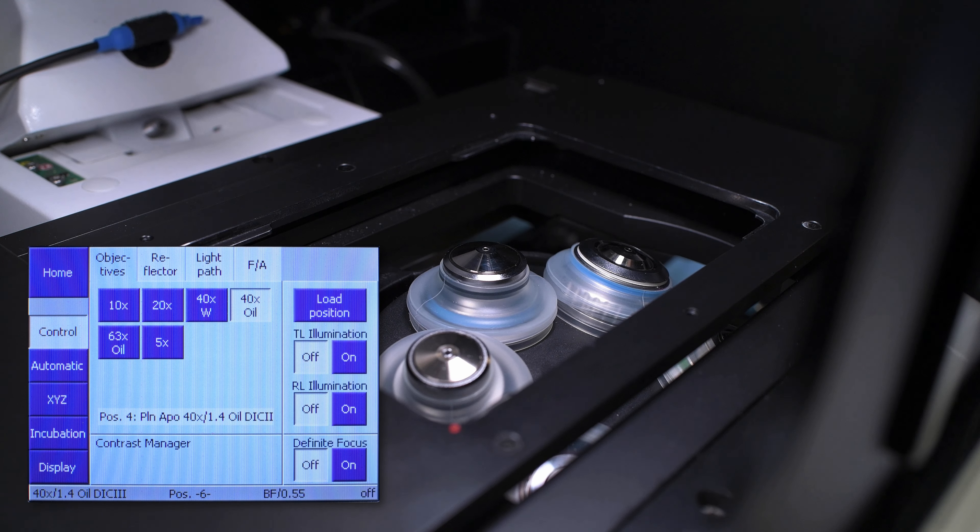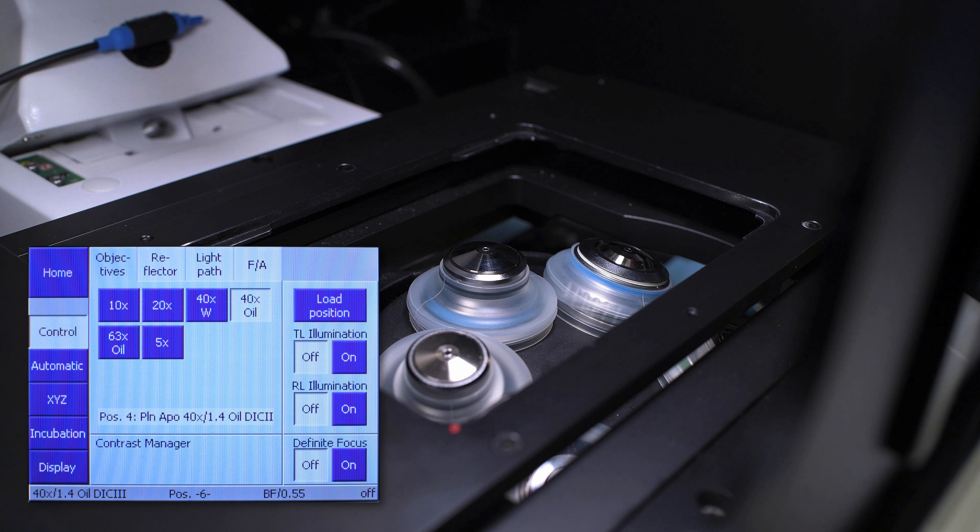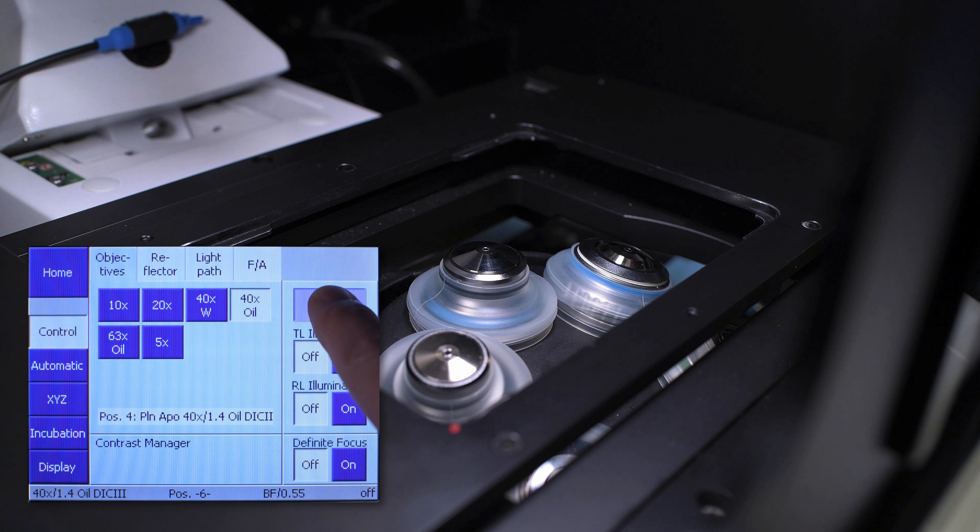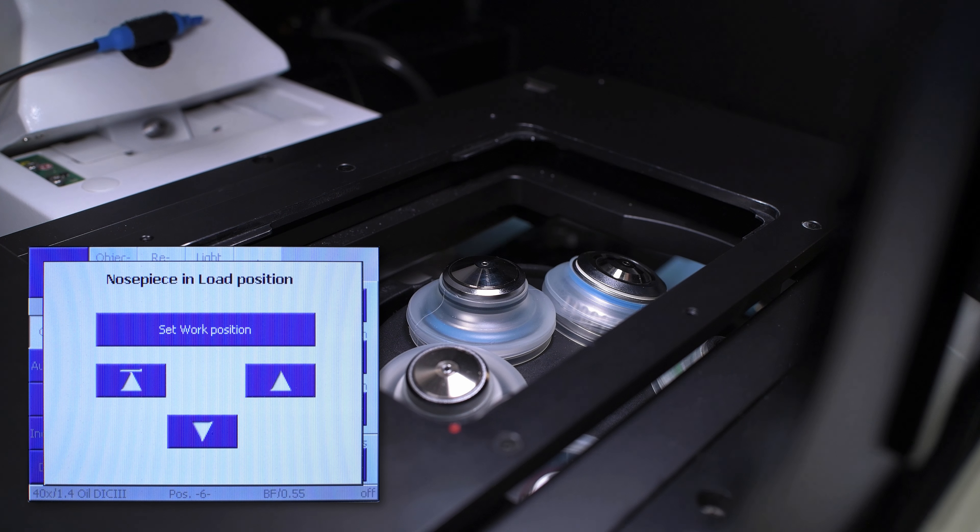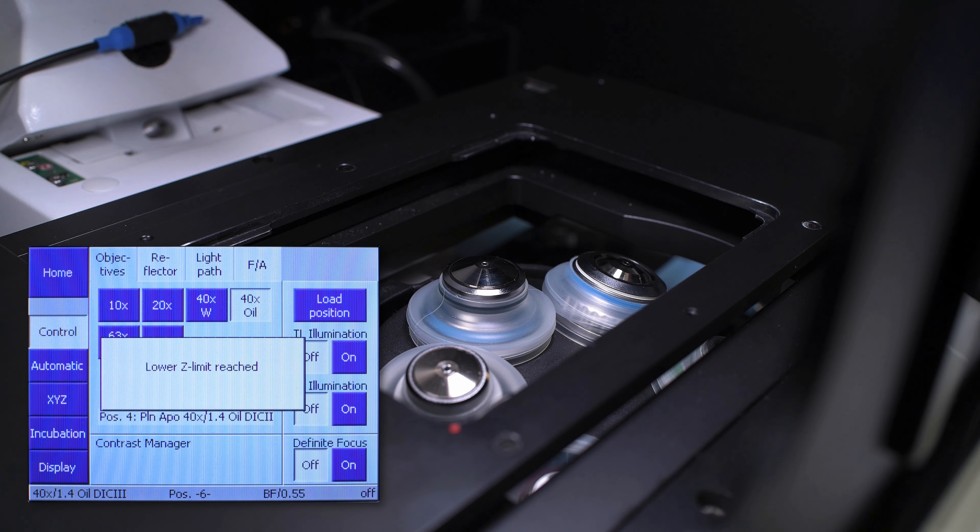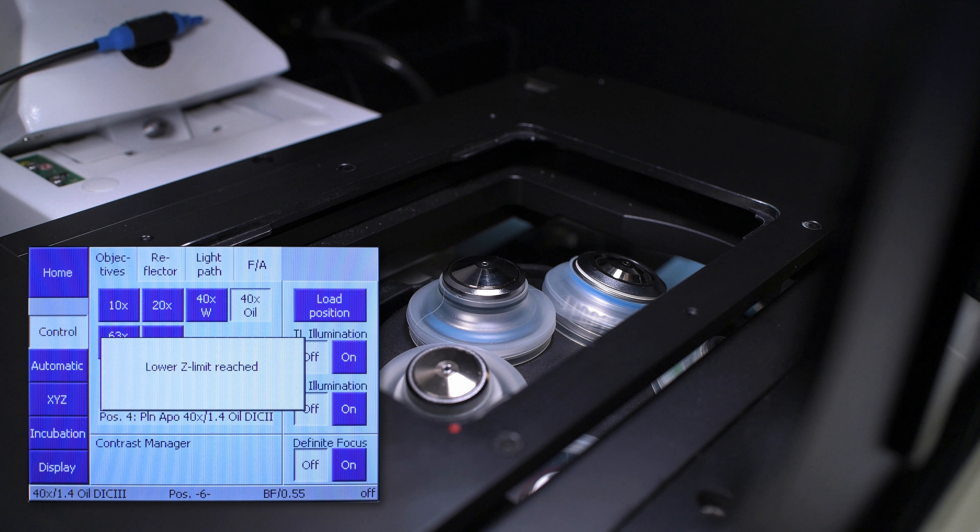If the objective moves its focus back up toward the specimen plane, we will need to adjust it. From the right side of the TFT display, click load position to move the objective to the lower limit of the focus drive. Then click set work position. This is the safest place for the objective while we mount our sample.